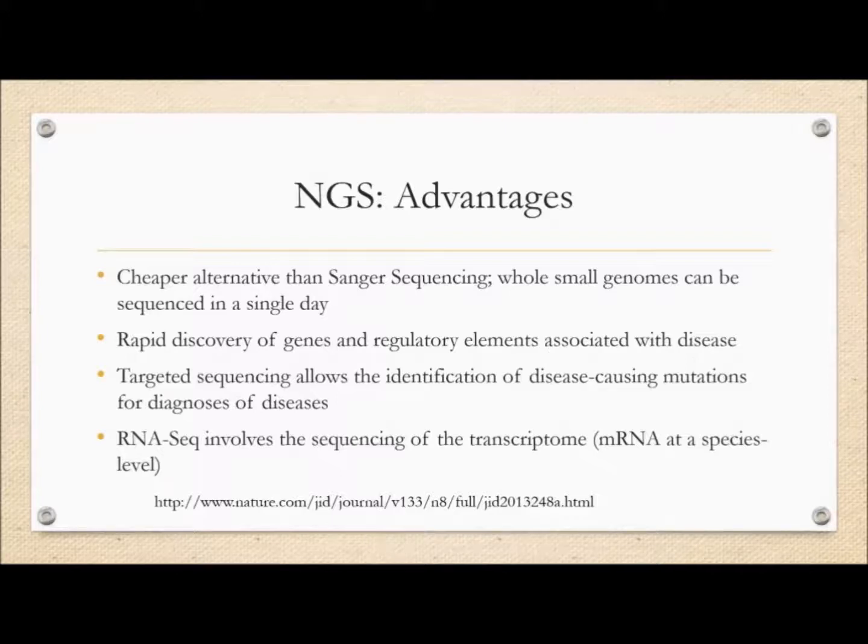So everything, and we discussed genome browsers and identification of SNPs and the potential for identifying SNPs potentially matched with certain diseases. Now imagine if you could do all that really rapidly, identify all of these really rapidly, and that's where the advantages of next generation sequencing come in.